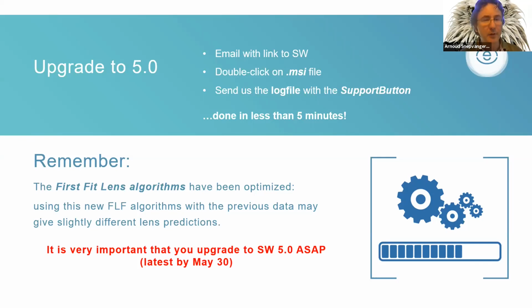We will email it out on Monday, is what we strive to do. It will come with a little instruction file, but all you need to do is download that single update file, double click and upgrade the software. All of your old measurements will be available as ever, so there's nothing lost in that sense.